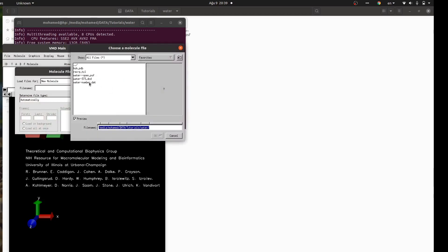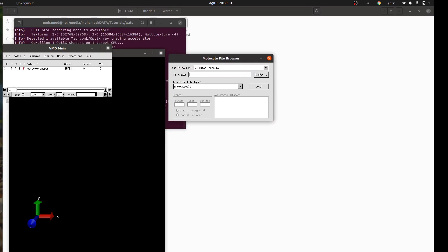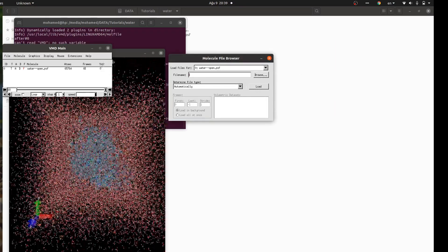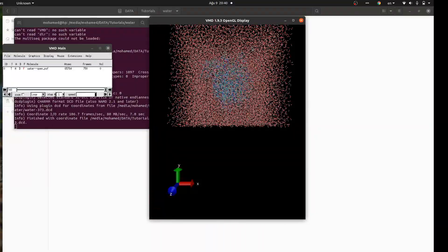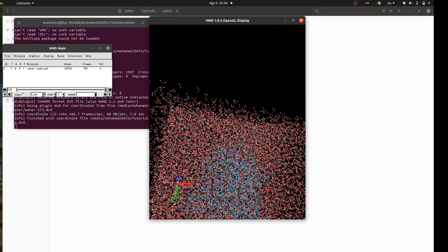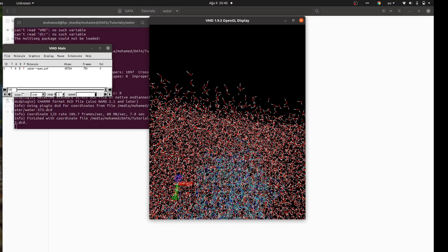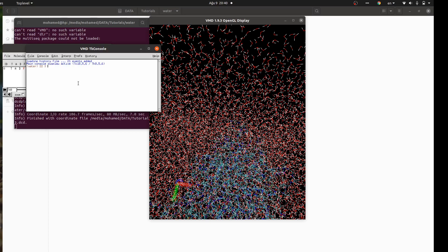I'll open VMD, load a new molecule — a PSF file for a protein simulated in water. It's a short trajectory of around 750 frames. I'll wait for it to load, then go to Extensions > Console and source the script we just wrote together: 'source res.tcl'. I'll hit Enter and it will take a while to calculate across 750 frames, then we'll check the output file.